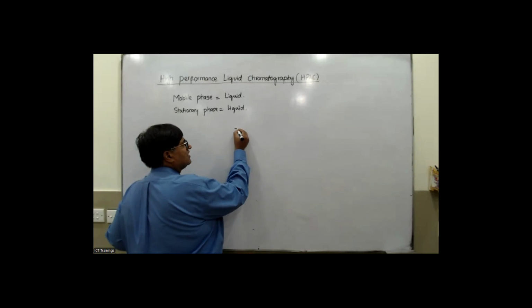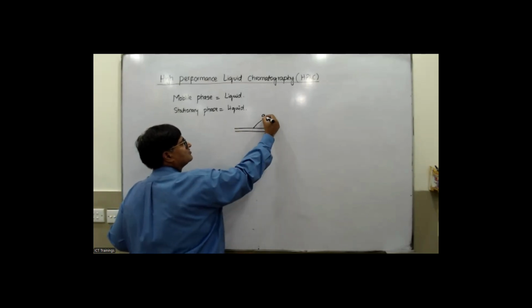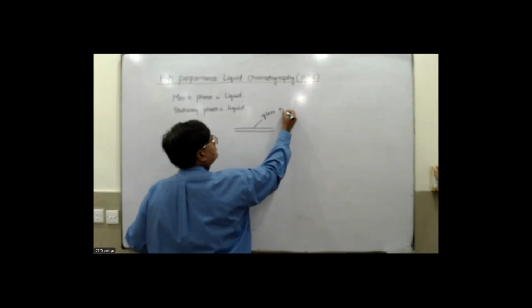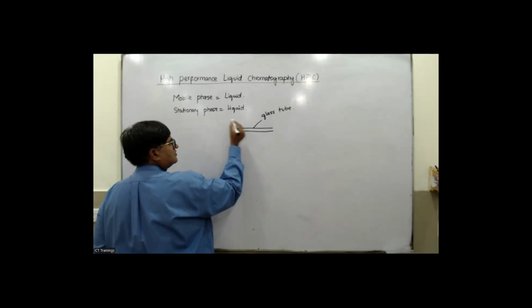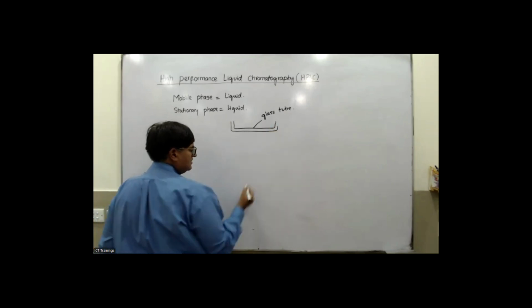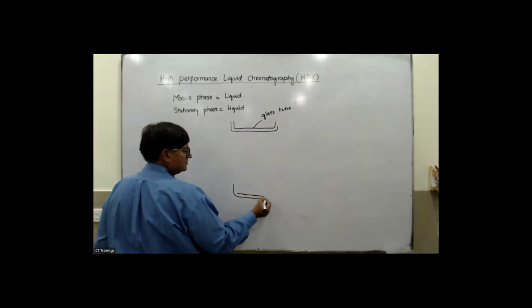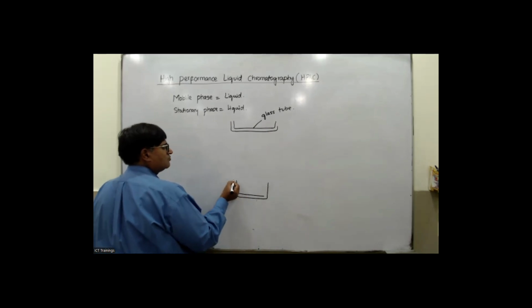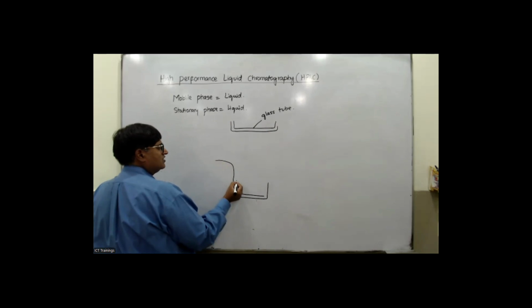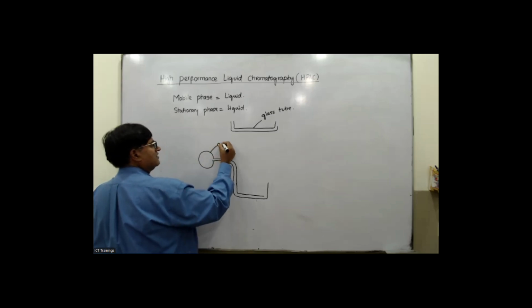In that case, you take a very small glass tube. This is a small glass tube. So this small glass tube, my dear, I'm going to make it up here. This is a small glass tube like that. Okay. So this small glass tube, my dear, is joined with the auto seal rubber in the same way.